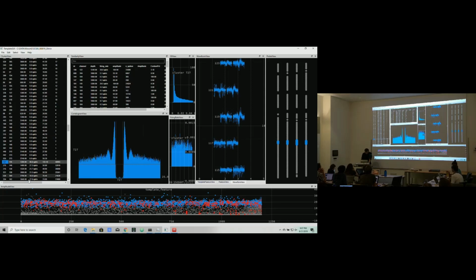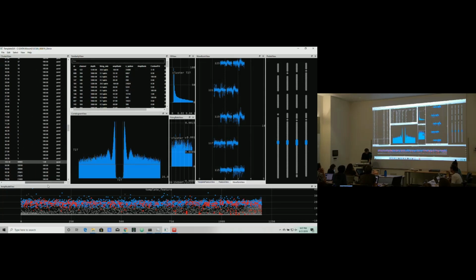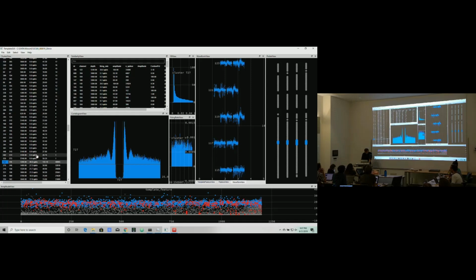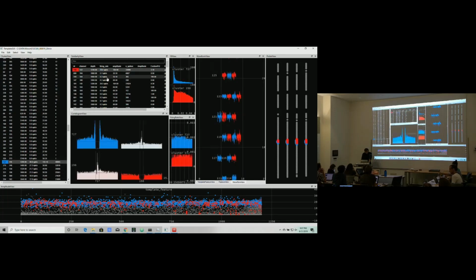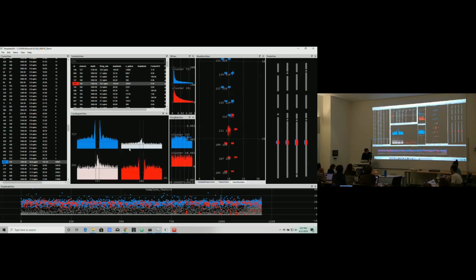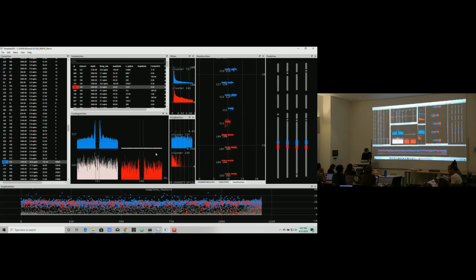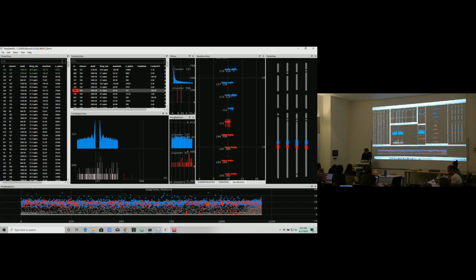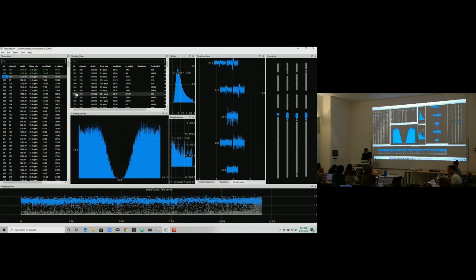This, however, hasn't been fixed. Whenever you merge something, it goes to the bottom of the list, and now you're in a completely different place. That's a little unfortunate. But let's finish curating this neuron. Okay, I don't see anything else similar to it. I see another potentially monosynaptically connected neuron. All right, cool. Let me go back to the top of my list. Go to the next one.